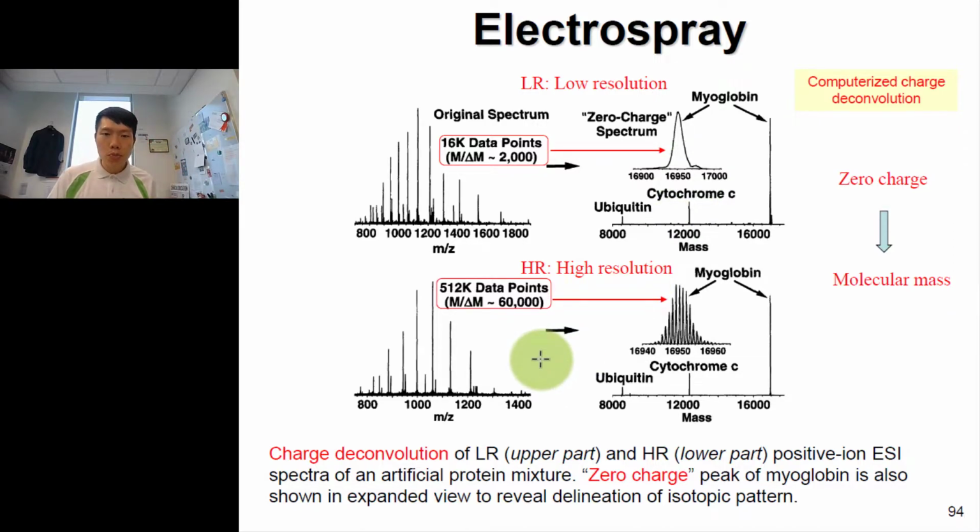Now, this zero charge doesn't mean no charge. I would like you to clear up this idea, because we mentioned that if a fragment has no charge, it's not detectable by the transducer in the mass spectrometer. So when you say zero charge here, it means that it is either positive or negative, but there's no fragmentation, and we're referring to this term under low resolution. No charge means not 2+, 3+, those kinds. Just a very tiny single plus charge for a very complex molecule.